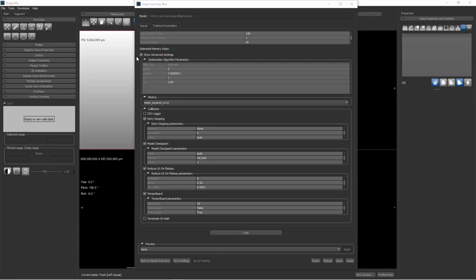Let's use that, and then if you want to ask a follow-up question on one of the future webinars, you can. Have a look at the link Benjamin provided, keras.io/callbacks. This will define all of these parameters. So you see all of these are marked as callbacks. This is not engineering on our part, or this is not feature development on our part. A lot of what my team does extremely well is just take the existing tools, which are quite strong, and do software engineering to make it accessible to you in a user-friendly interface. So in this case, most of what we're doing are not developing new features, but simply doing the software engineering. So you can find those features documented in the source project, specifically at the Keras website.